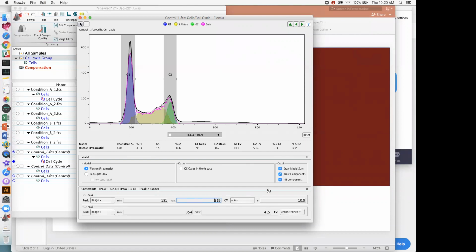Okay, now just to give you a quick reference here, we'll go back to 7. You have to click off that box in order to get it to apply. But the minute you apply it, the model will reflect what you have there. Okay, in my case, between 7 and 10, as far as personal taste goes, I would say that the 10 is a little bit better of a fit to my eye, simply because it looks better.